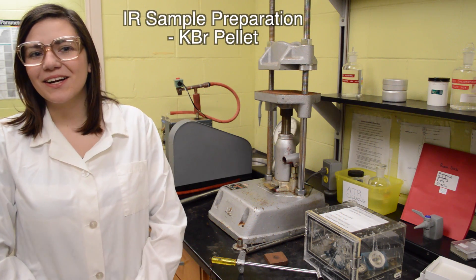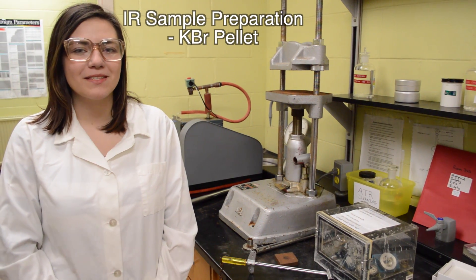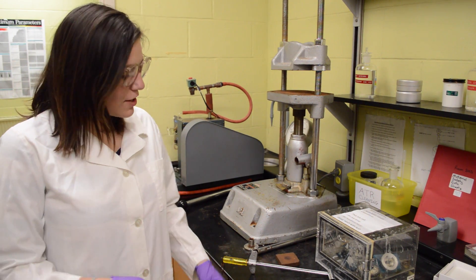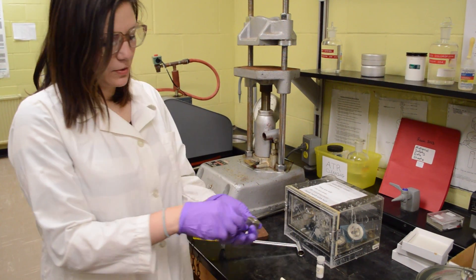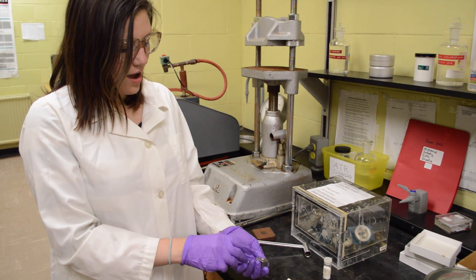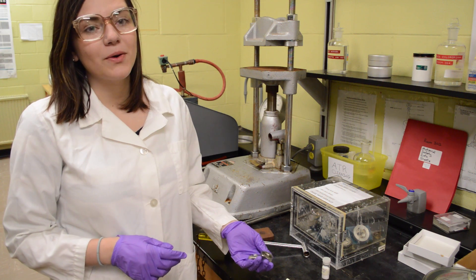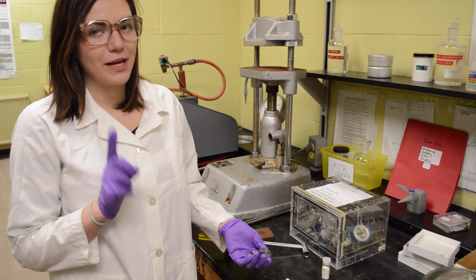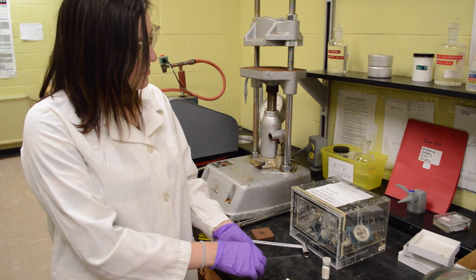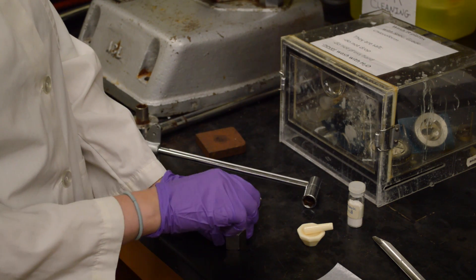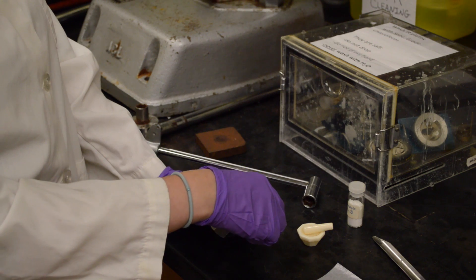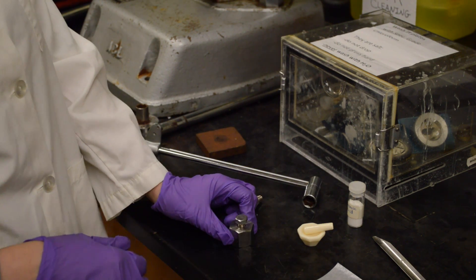Today we're going to learn how to make the KBR wafers for a different type of IR analysis. First of all you're going to get this bolt, and this bolt, and barrel. They're going to be really hot because you're going to get them out of the drying oven, so make sure that you are very careful when you handle them. The first thing you want to do is insert one bolt into the barrel until two threads are visible above the barrel, like so.